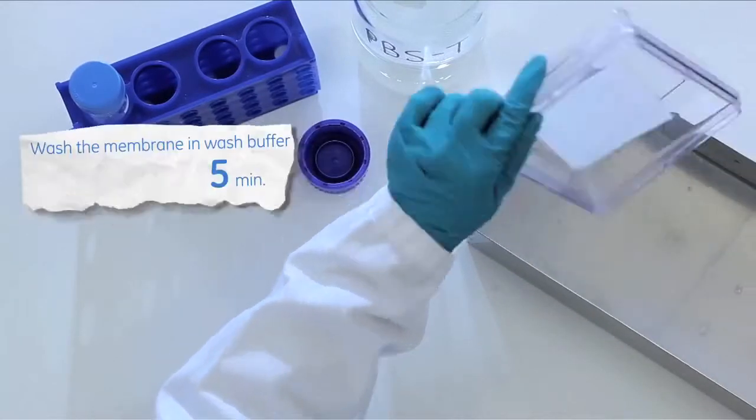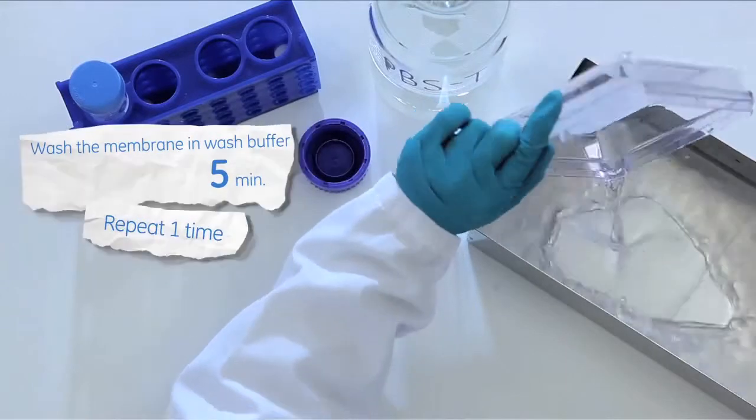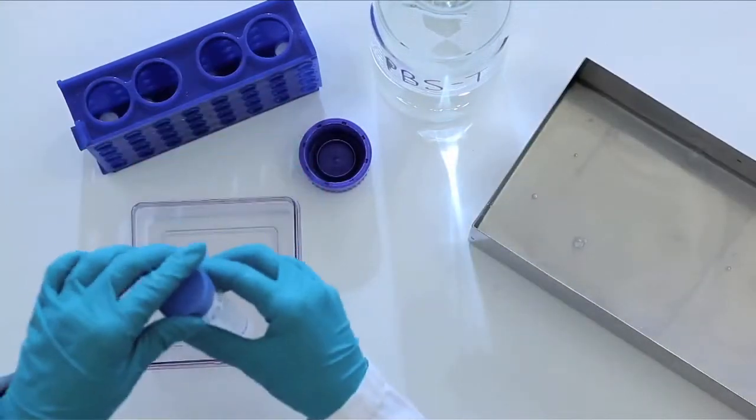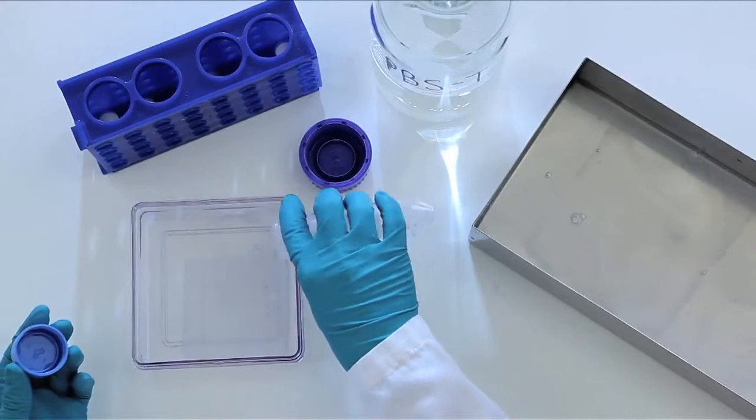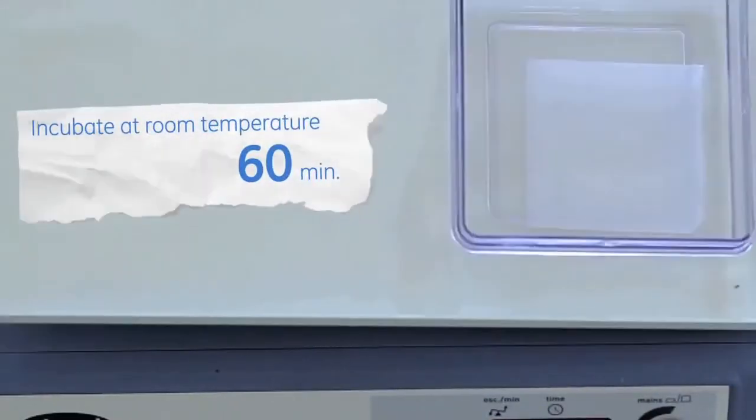Next, wash the membrane in wash buffer for 5 minutes. Repeat once more. Add the primary antibody, diluted in PBST, to the membrane. Then incubate on the rocking table for 1 hour at room temperature.